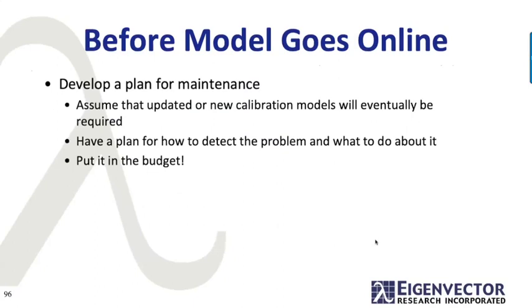So before your model goes online, develop a plan for its maintenance. We've seen too many instances of models that were making a lot of money for people that then stopped making money for people, and they had no money in their budget to update them to keep them working right. So, plan on this at the beginning. Put it in the budget.